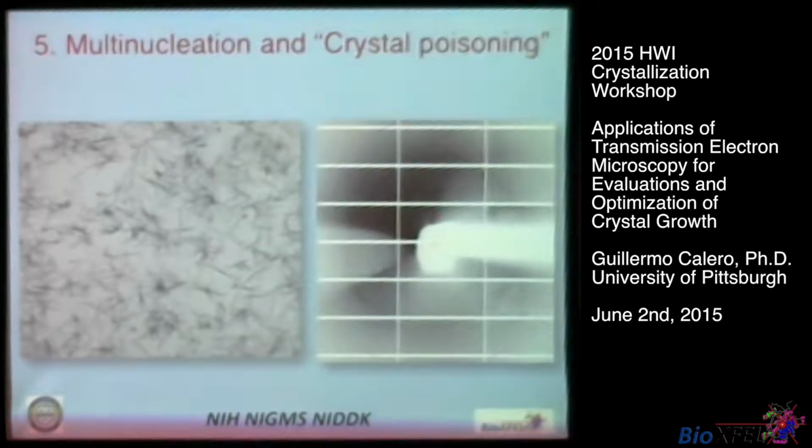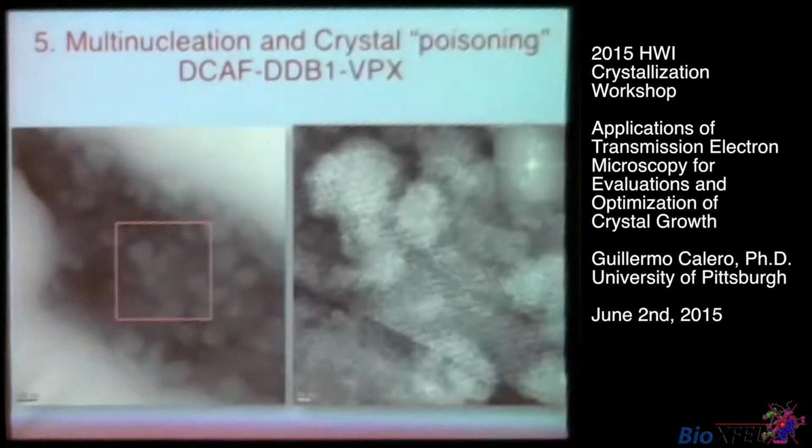So we were curious what was happening here, and why we couldn't improve it. We took this to TEM, and as you can see here, this is an example of that crystallization condition. You can see all these aggregates.